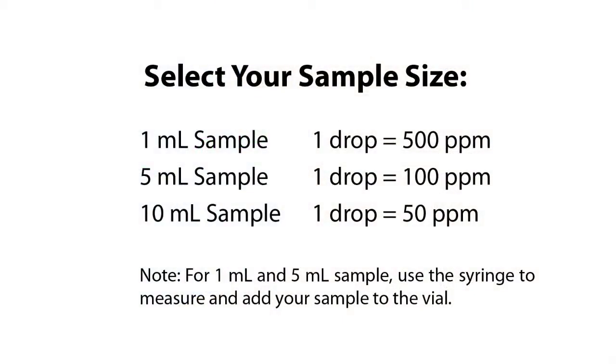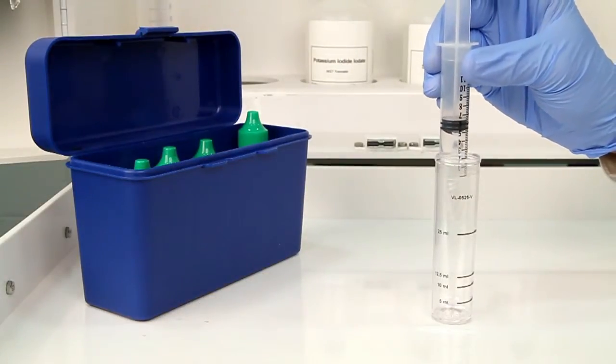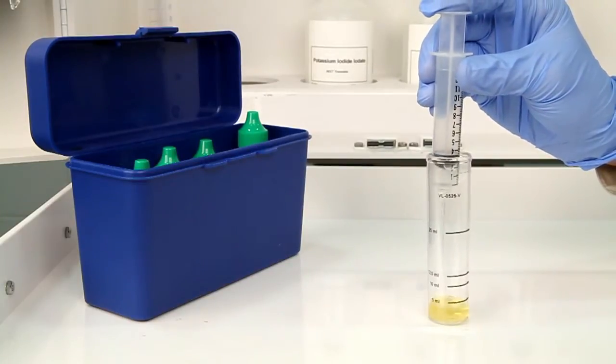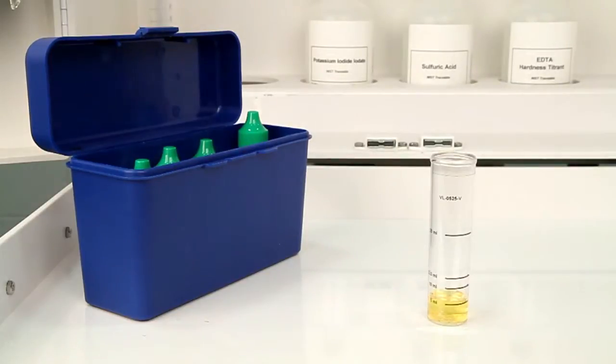The next step is to choose your sample size based on your desired drop equivalency. Use the syringe to accurately measure your sample and then add the sample to the vial. A yellow color indicates available chlorine dioxide. Swirl the vial to mix.